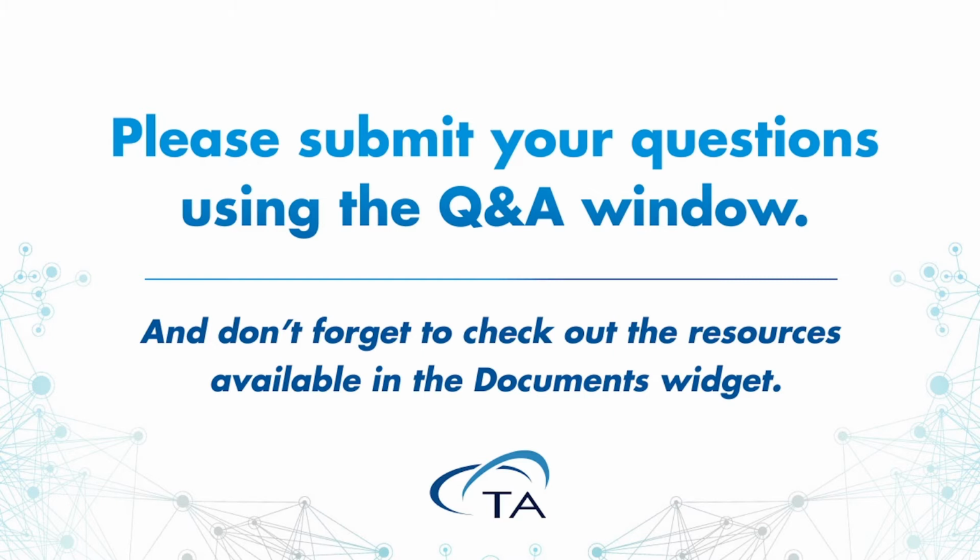Well, Ed, when I saw this one come in, I thought in two different ways. First is troubleshooting the hardware. And when you have complex instrumentation, you want to be able to have something where you can troubleshoot it and make sure it's working correctly. So one of the things that we try to do, especially with isothermal titration calorimetry, is a technique called water-water titration.